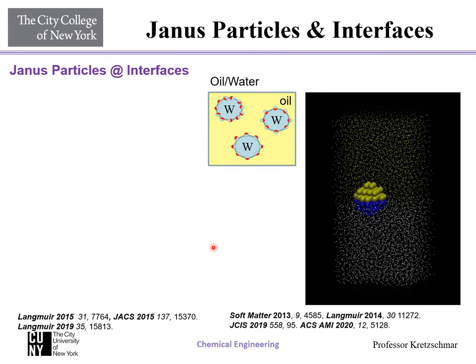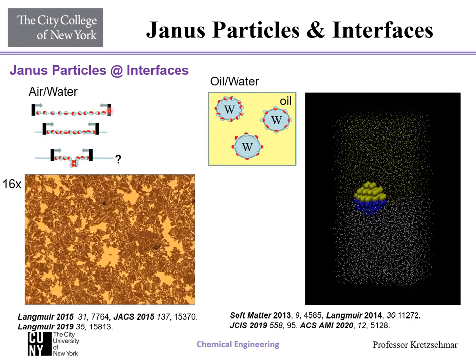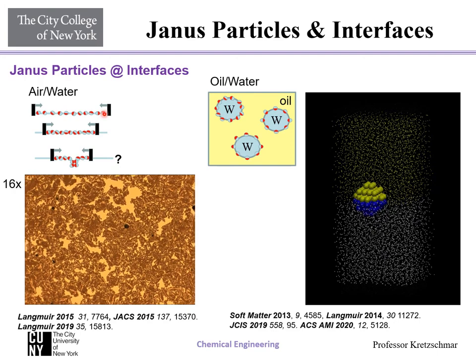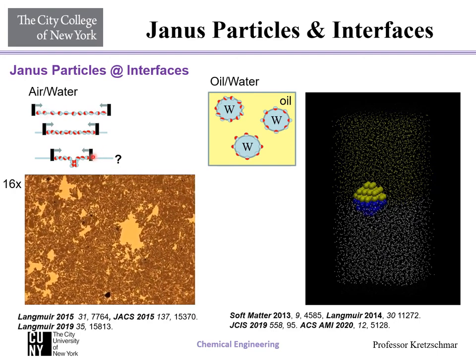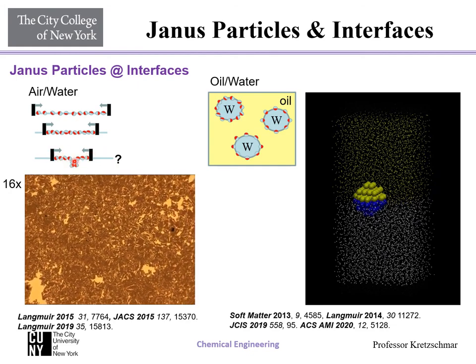We have also looked at these particles at the air-water interface using a Langmuir trough, and here you will see that as we are compressing these barriers, so as we are moving these barriers closer to each other, we are compressing this particle layer. The particle layer gets more and more dense, and eventually you will start to see it forming folds, just like a fabric would form a fold.